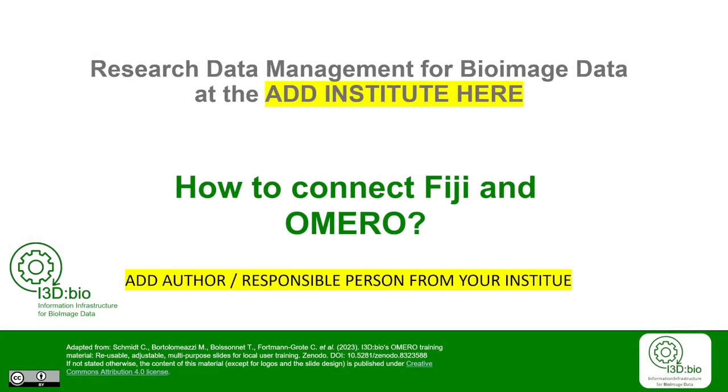In this video, we exemplify that OMERO is not only a place to store data, but it is a place to actively work with data. Here, we focus on the connection between Fiji and OMERO.